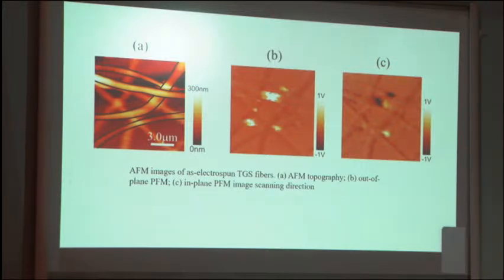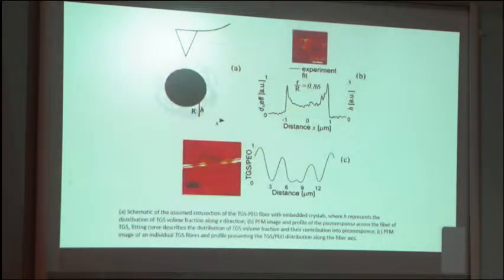And if it's not enough, because for determining the piezoelectric coefficient we need several images, it's possible if you rotate the sample to detect the third component, and in this situation it's possible to estimate the piezoelectric coefficient in your materials.